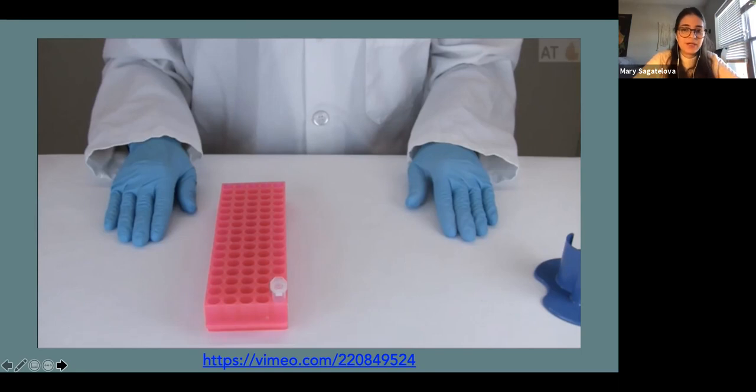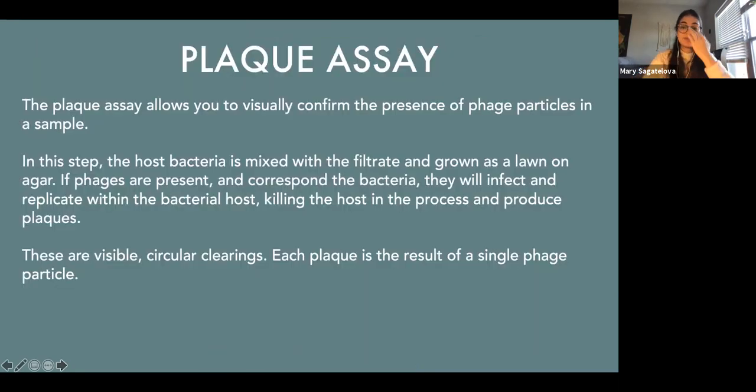Hopefully we got that. Okay, so now that we've done that, that was our direct isolation, right? We have isolated some phages into a solution from our environmental sample. Now we have to visualize those phages, which is where the plaque assay comes in.